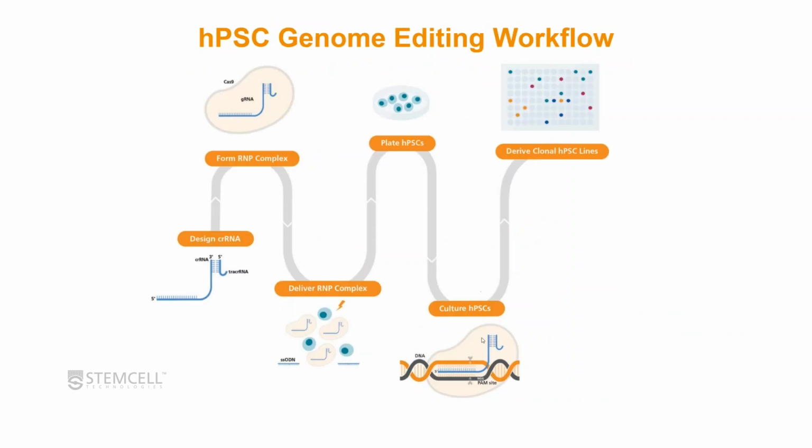Once you know that, let's say you want to select 20 clones, you can single cell sort those clones into a 96-well plate, or you can plate them at very low density in order to derive clonal pluripotent stem cell lines.